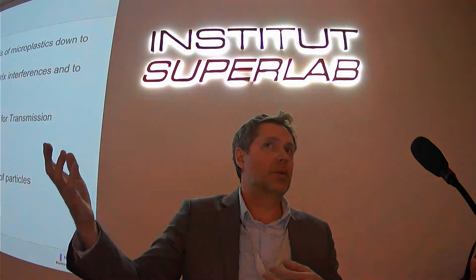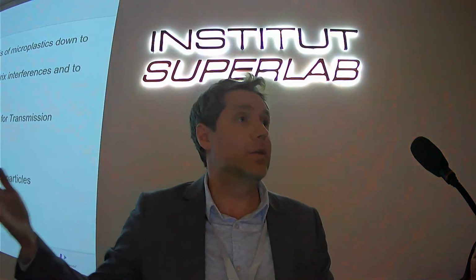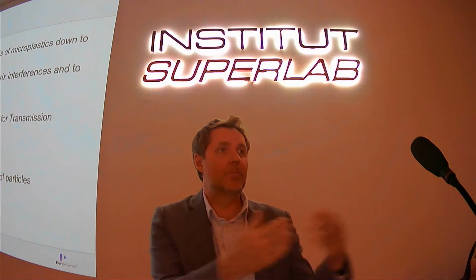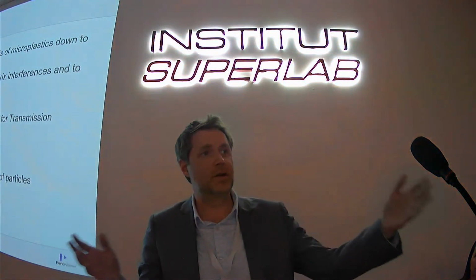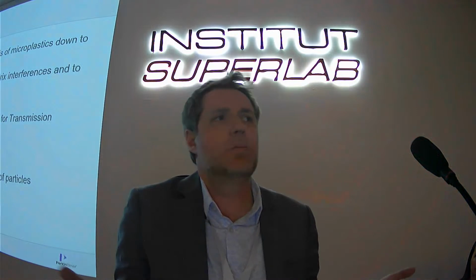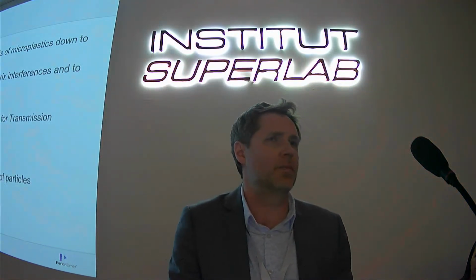So you need to run a background or it won't let you run the sample. However, some people like to see a background subtracted. Some people like to see the data raw. The data's there, you can decide for either. And I think, again, that would be the same between all vendors. I don't think there's any difference there.